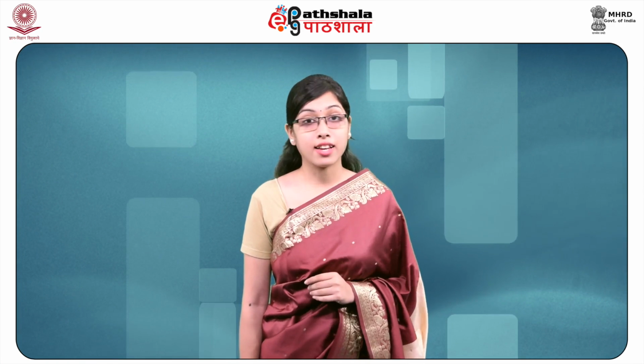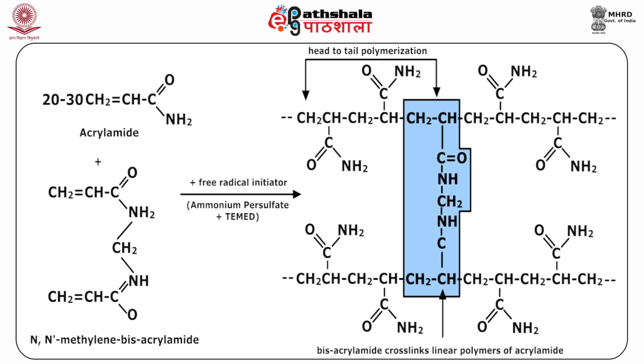Polyacrylamide gels are formed from the polymerization of two compounds, that is acrylamide and N,N-methylene bisacrylamide. For the gels, bisacrylamide acts as a cross-linking agent. The polymerization is initiated by the addition of ammonium persulfate, that is APS, along with N,N,N',N'-tetramethylethylenediamine, that is TEMED, that acts as a catalyst.